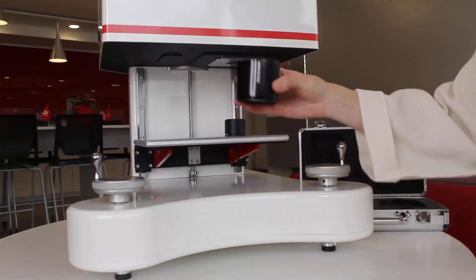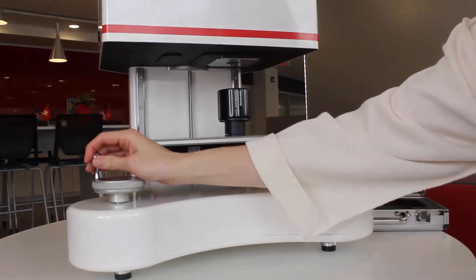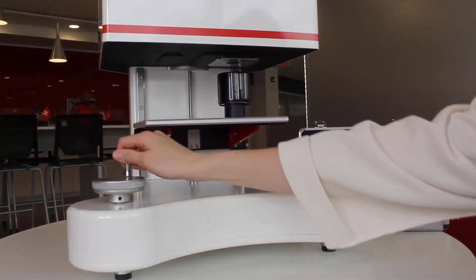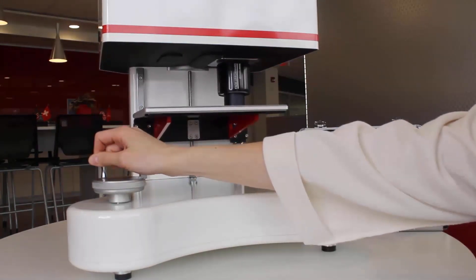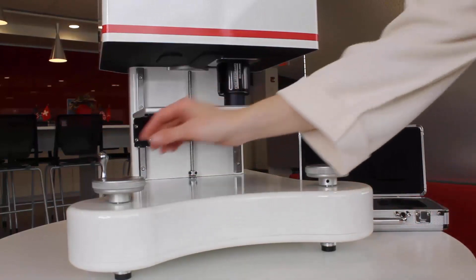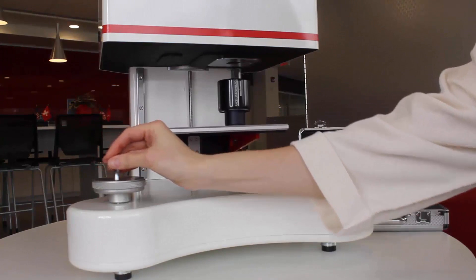Rotate to raise the sample tray and black trap up to the aperture plate. This can be done by rotating the fine dial until the black trap is flush against the aperture plate. Once the black trap calibration has finished, we will place the white tile. Lower the tray by rotating the coarse dial, then remove the black trap and place the white tile flat on the stand.